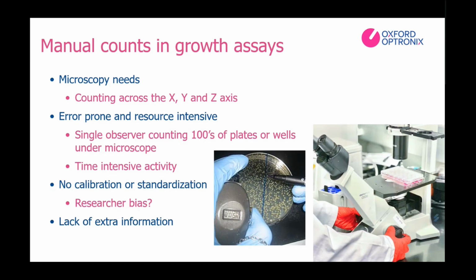Is there also potential in a particularly small set of organoids that a larger one that is under the absolute minimum value is still counted? In practice, this means an error of only plus or minus 10% in the visual estimate of organoids across samples can result in massive errors of more than 50% from plate to plate. Since size can be difficult to determine accurately, this issue can contribute to large errors when counting organoids.